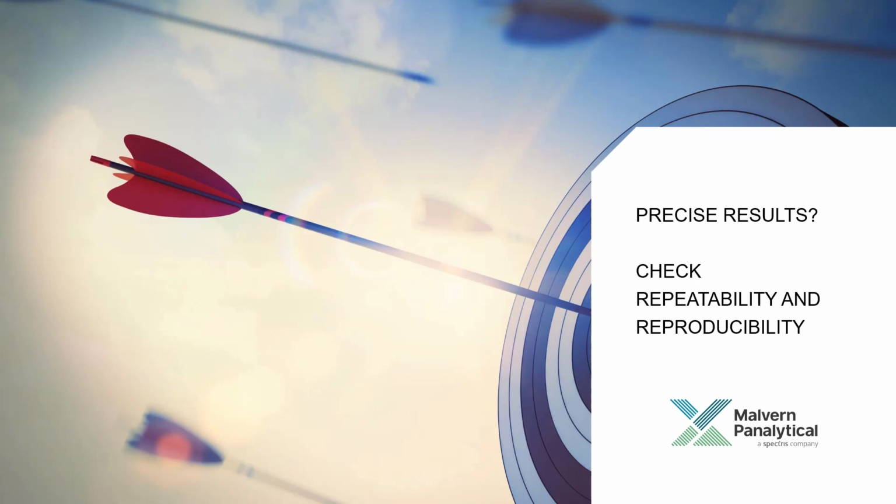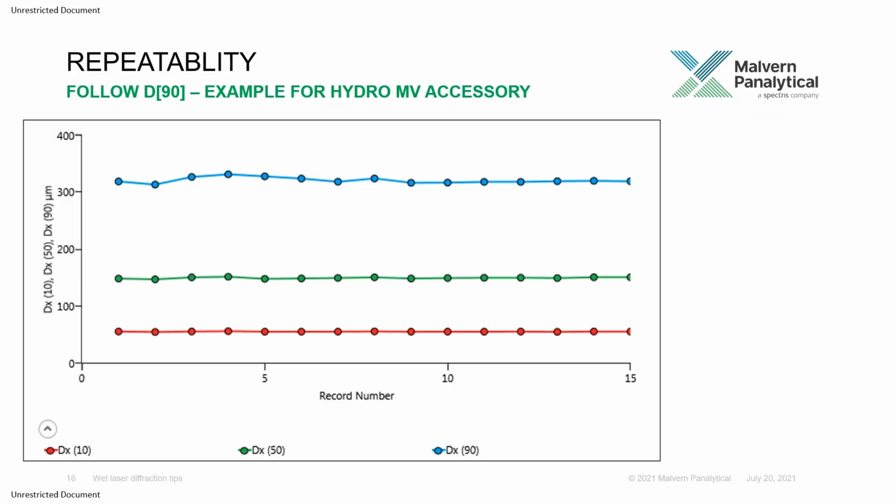Once stability is reached, you need to check precision. This is typically done using repeatability and reproducibility studies. Let's start with repeatability. Once the dispersion is stabilized, the only factor that influences repeatability is measurement duration. This needs to be long enough to make sure that the largest particles have time to circulate to the flow cell and be seen by the laser.